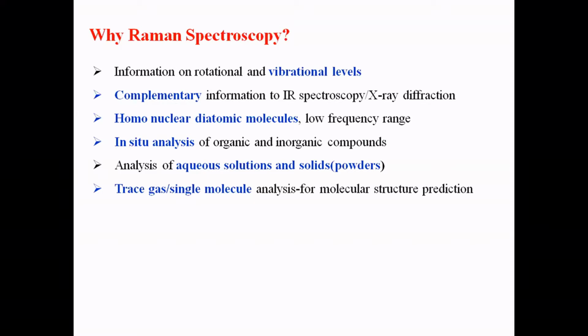And in situ analysis is highly useful for organic and inorganic materials, so you can easily do it by Raman. The analysis of aqueous solution-based compounds or solids, in any form, we can easily acquire the spectrum. So these are the key advantages. And the sensitivity or detection limit is quite high. If someone plays with the key parameters of the laser, you will be able to precisely identify the impurities. Even a very small amount of impurity, or some small dopant effects, can be easily predicted by the Raman shift value. So that way it is superior to other techniques.